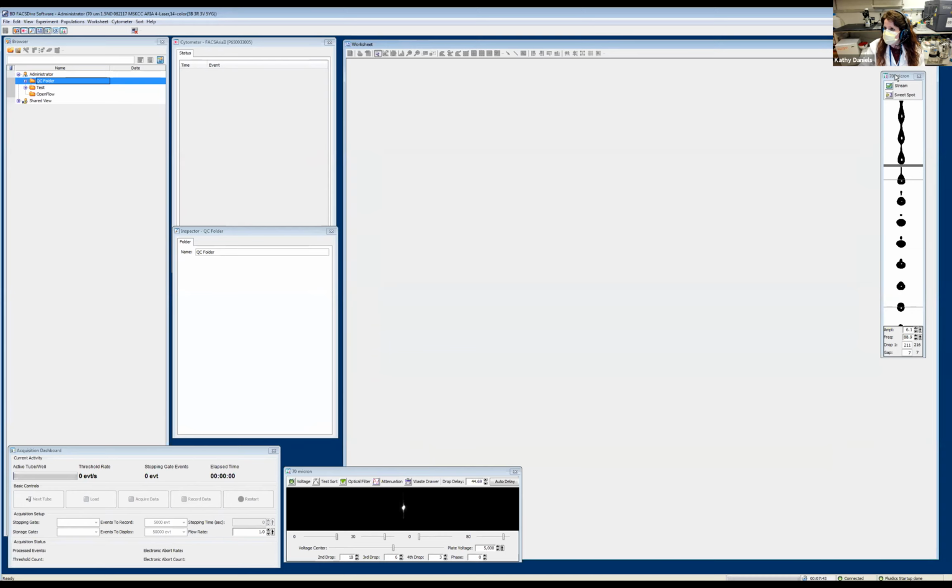What we can see when we're looking at this window right here is the droplet formation. And we have this gray bar right here, which is the gap. That gap is showing the difference between the last attached drop and the first detached drop and the satellite drop right here.